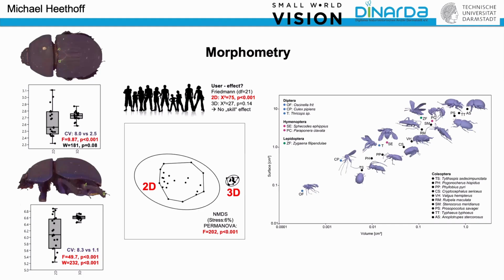That's cool to use 3D models when you want to do size measurements. And also when you want to have access to measures that you can hardly measure on a complex object. For example, the surface and volume. It's easy to calculate surface and volume from geometric structures like a ball or cylinder. It becomes much harder when you have a complex object. When you want to know the surface and the volume, this is only possible when you have a digital model, a digital twin.